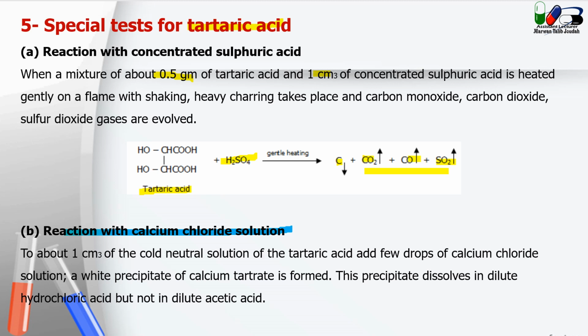So first of all, the 1 ml of the cold neutral solution, it must be cold.